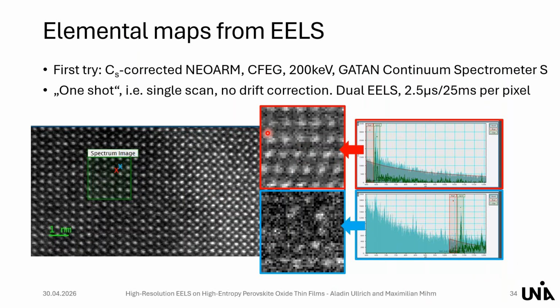As an example, here for the manganese and for the gadolinium, no, it's the samarium map. You see the manganese, as expected, shows a quite periodic lattice, since this is the host lattice, and the rare earth metals, so the samarium here, is only present at specific atomic positions, but there are places where you don't get any signals from it.